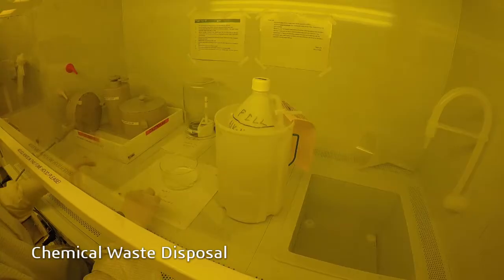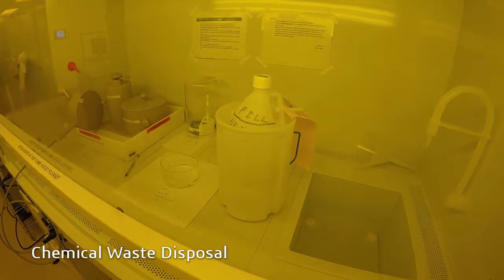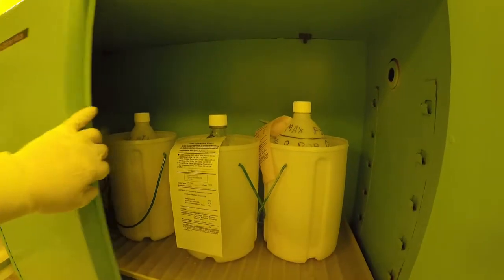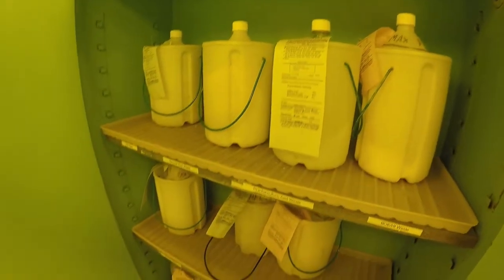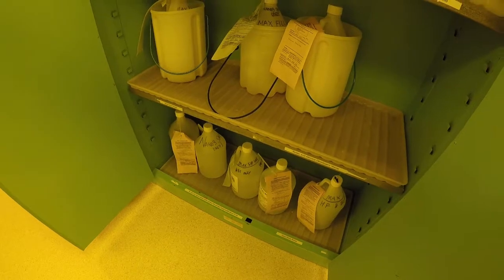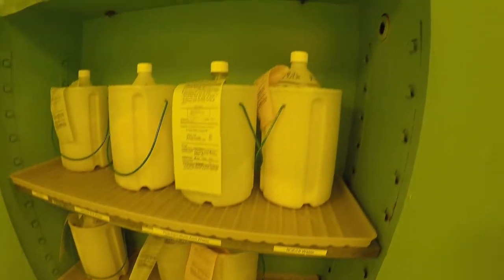At the end of your processing, you must properly dispose of used chemical waste. Never pour any chemical down the drain. Go to the waste bottle storage and identify the appropriate waste bottle for your chemical by checking the chemical waste tag attached to the bottle. For your safety, always double check that the chemical being disposed of is listed on the waste tag.